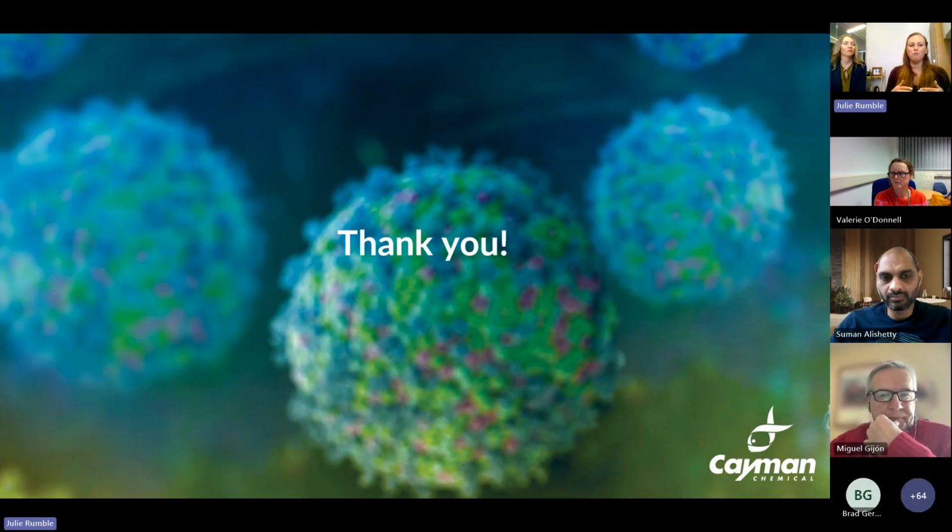There are things about C14-4 that may aid in transfecting T cells over some other lipids, but it's not all or nothing. That is something that we have definitely discovered over the course of these studies, that you almost always get some transfection, right? It's never no transfection. These LNPs are really good at getting into cells and expressing a cargo.